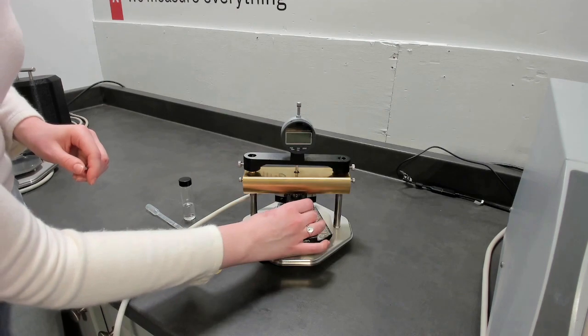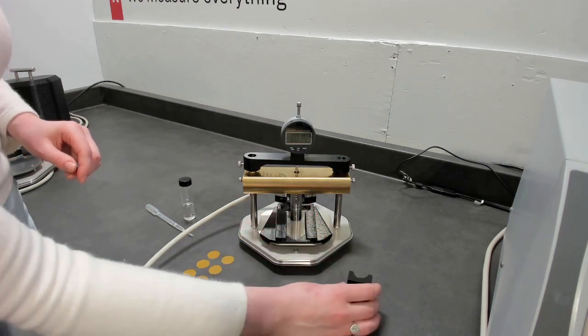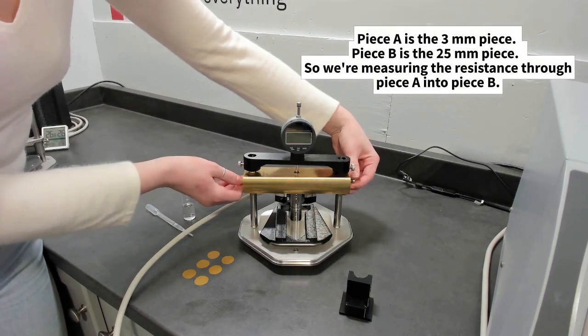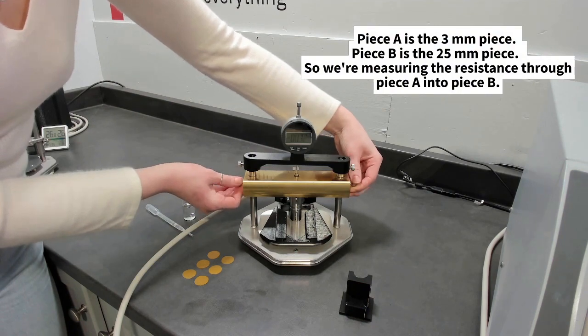These are 21 millimeter diameter pieces. Piece A is 3 millimeters thick and piece B is 25 millimeters thick. We're measuring through piece A and into piece B.